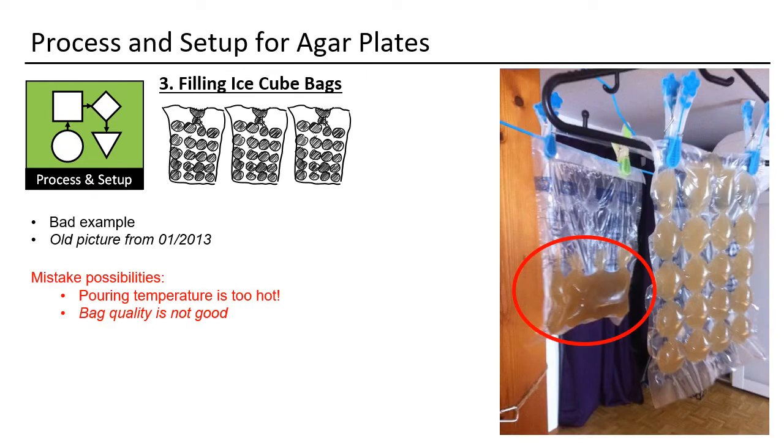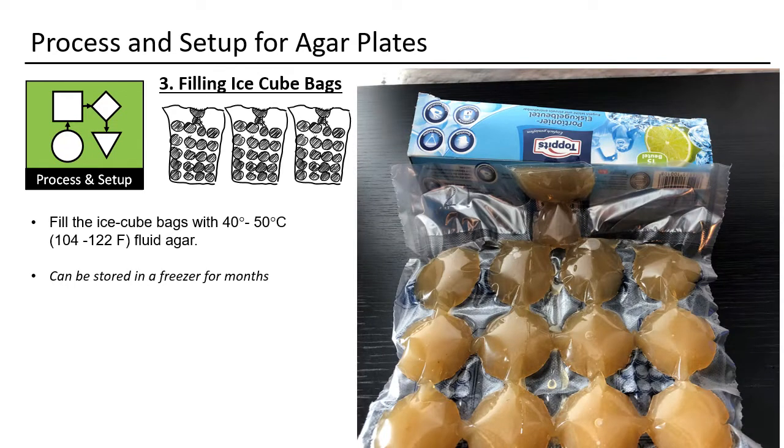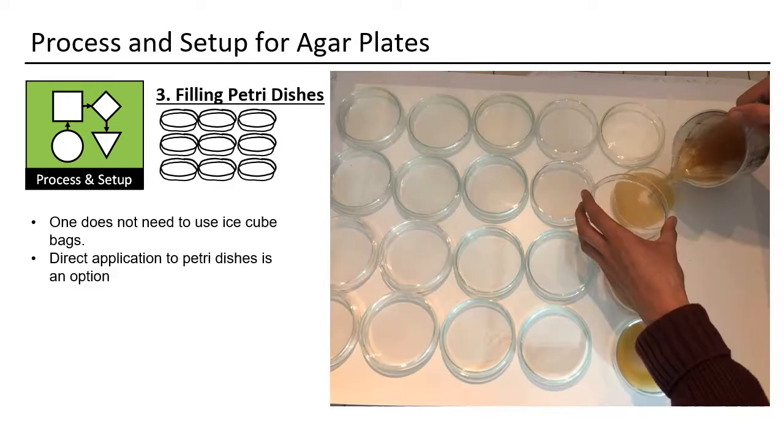Please buy some quality ice cube bags. The brand does not matter. If you fill it too hot, the bag will not function properly, no matter the brand. Lift the end of the bag a little bit to ensure proper closing. You do not need to use bags. You can also pour it directly into a petri dish. When you have finished your agar run, you can move on to cloning.